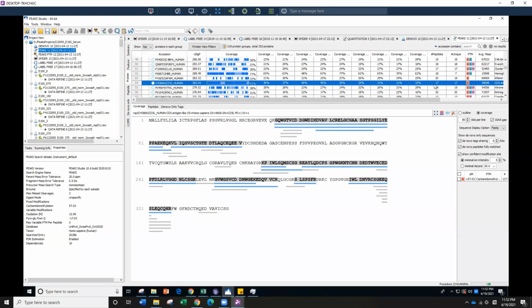And we see 17 peptides, and all 17 peptides are unique to this protein. If you're looking at, let's see, some immunoglobulin, you can search your protein here by changing the accession number or typing immuno.